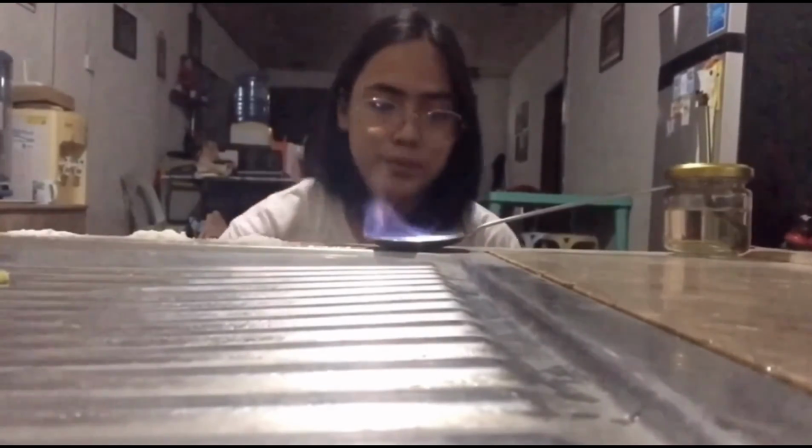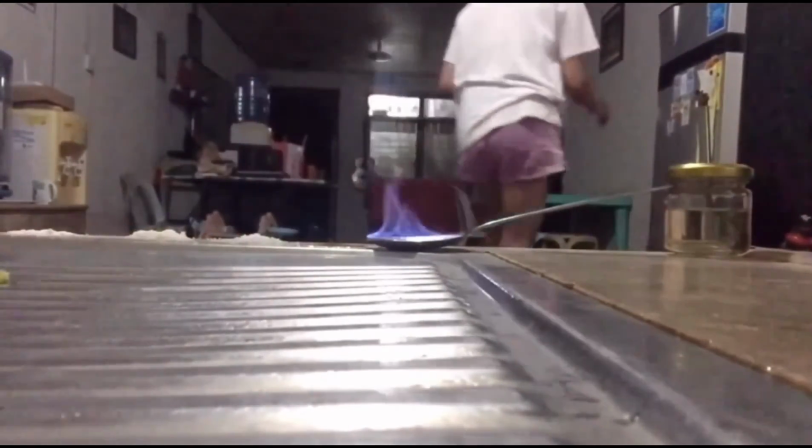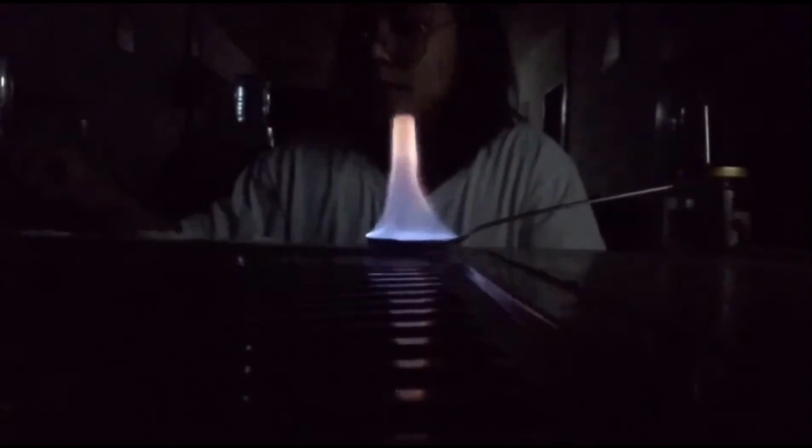So after putting fire on the ethyl alcohol, let's turn off the light first so that we can clearly see the color of the flame. The reason why there's a little bit of orange in the flame is because the alcohol solution is 70%, but if you buy 100% ethyl alcohol, surely your flame will fully turn blue.